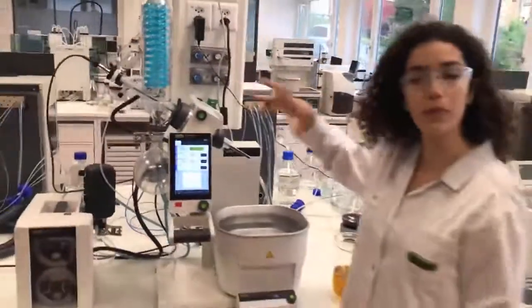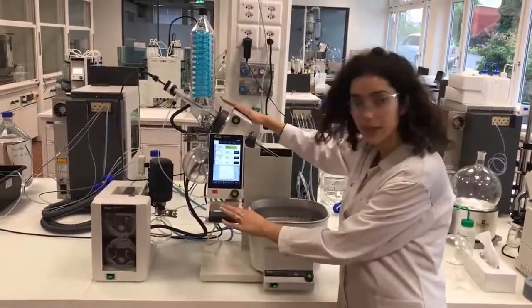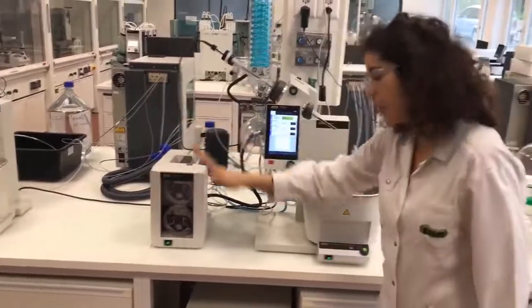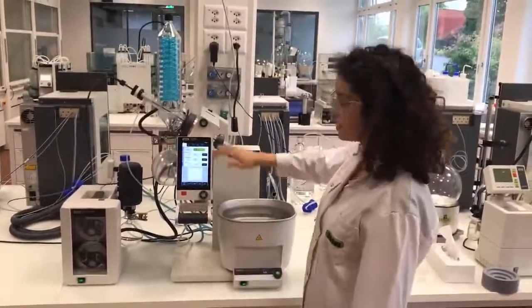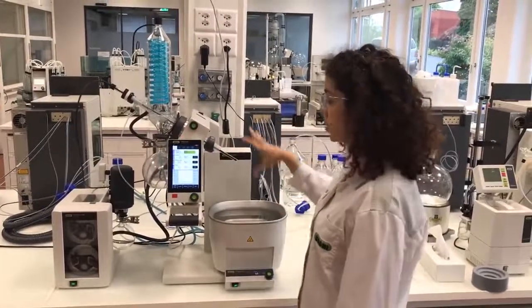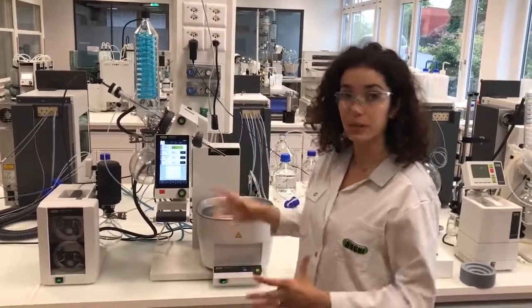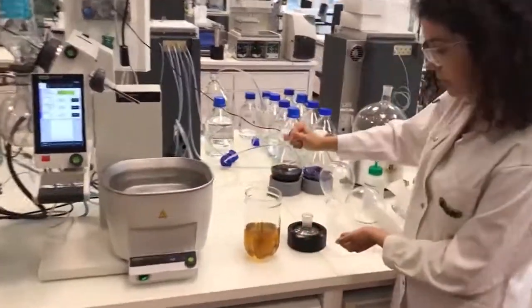That's a full rotary evaporator system. You can see the Vapor, the vacuum pump next to it, and the chiller just down there. You can also see the interface here that is connected to all the systems of the rotary evaporator. Please come a bit closer here.